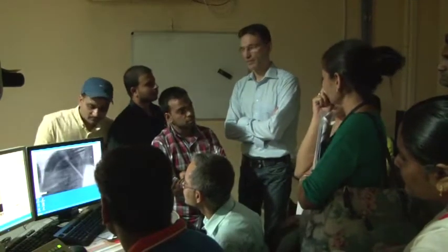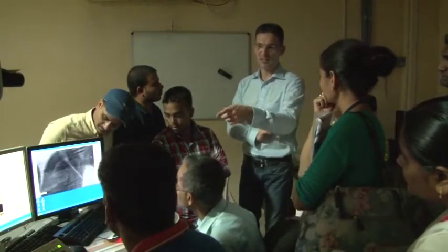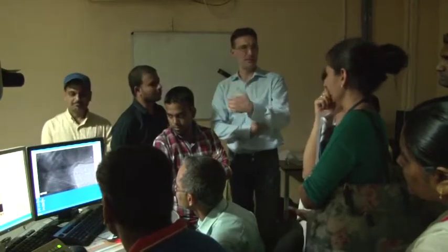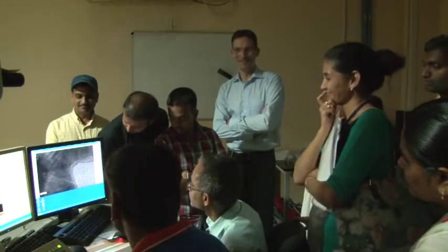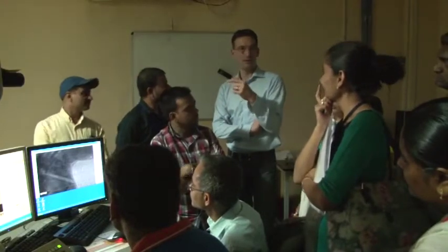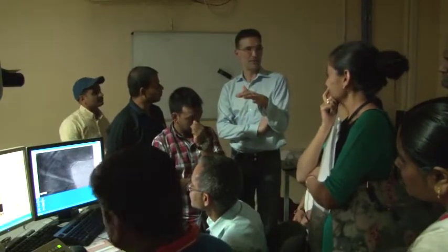No, it's quite stable. But as they are touching the table, you will immediately see them in the STEM image. So when you direct the effects, they can tell you. And there are many more aspects. I mean, there are 20 people in here, so the temperature changes. Temperature change within the lab here plays a role.